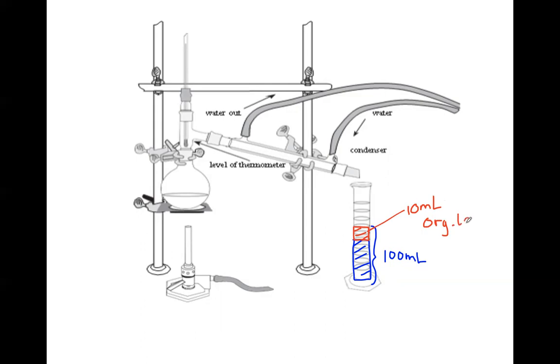As soon as you have 10 mils of the organic layer, you're done. Do not waste time to continue to distill. It's a complete waste of time. As soon as you have 10 mils of top layer, finish it and move on, okay? Because otherwise this could take forever.